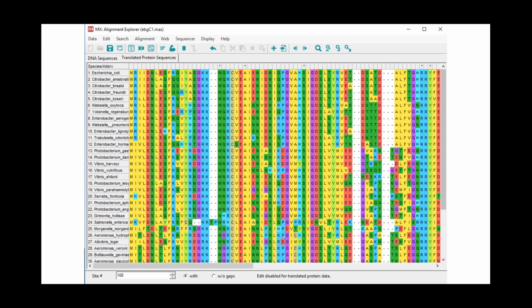you have an alignment. Now, what it will show you is the translated protein sequences. And the important thing to notice through here is that they're all real amino acids. If you have frame shifts in there, it'll show you stop codons eventually. It'll show you question marks if it doesn't know what amino acid to use. So it has worked.